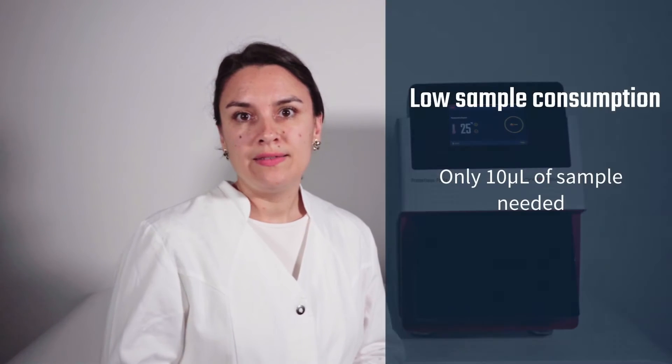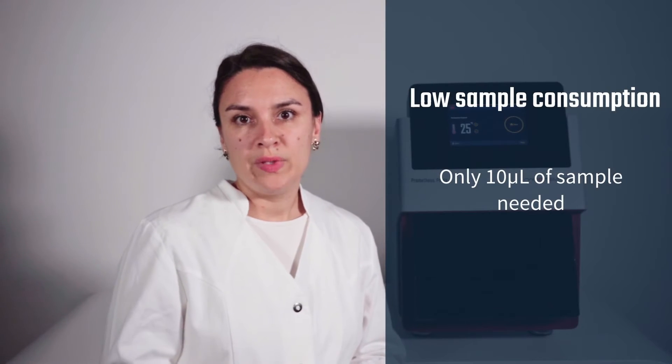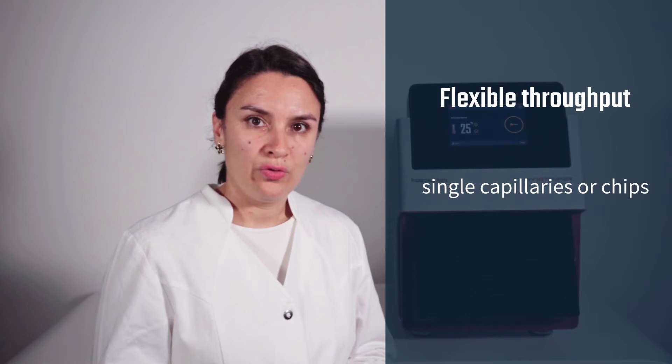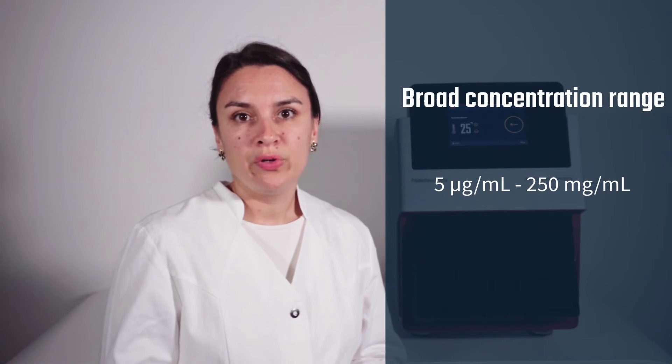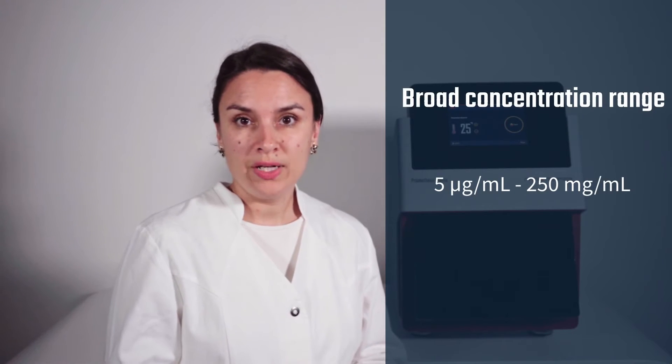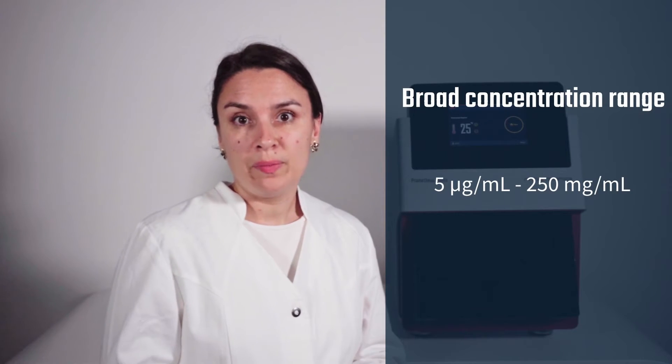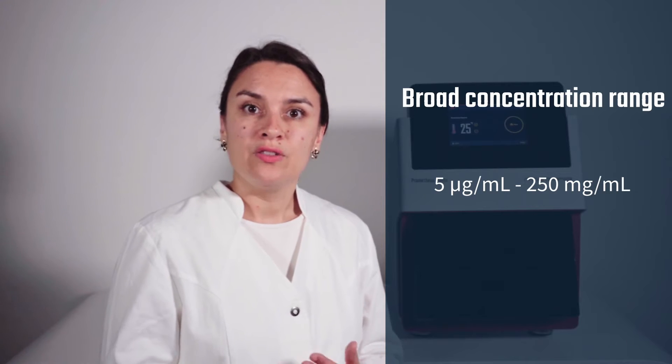Once you have your samples ready, you're good to go. Using only 10 microliters of sample, Prometheus Panta allows for flexible throughput and measures a very broad concentration range, starting from 10 microgram per milliliter up to more than 200 milligram per milliliter.